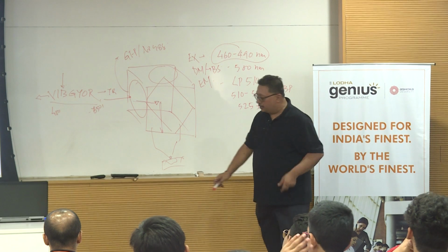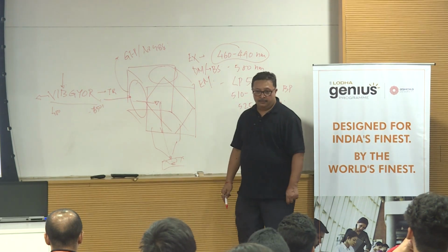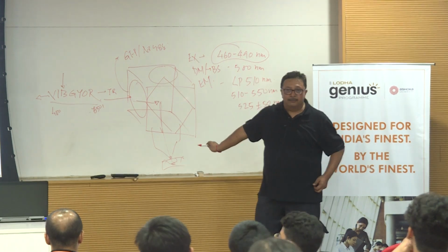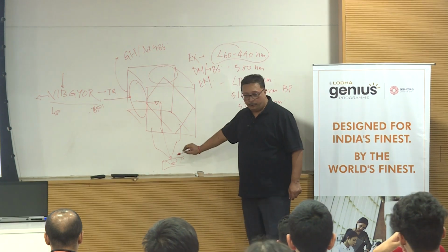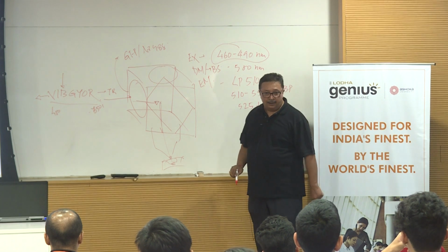So far so good. Now the blue light excites your sample. Clear so far? Any issue up till here? Now that you have excited your sample, wherever you have the fluorophore or the protein or the tag, it will be excited.